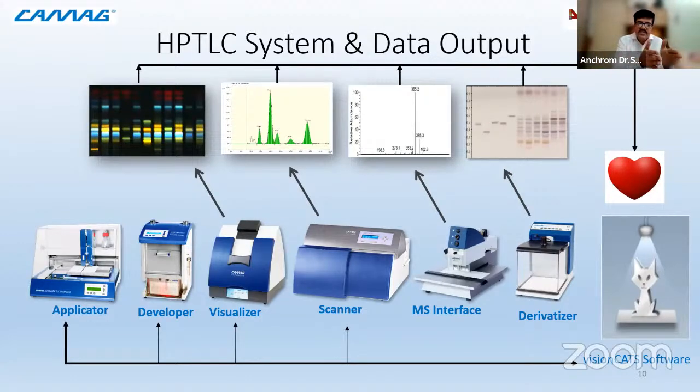Here you have the first step, the applicator, which does the primary job of applying the sample onto the plate. A lot of science is also involved in it, and I will come back to it when I talk more about the application. Typically, when we do a spot application, we spot it and either allow it to air dry, or sometimes blow air over it so that it dries quickly. If I have to load a larger amount of sample, I have to give multiple spots, and this takes a lot of time.